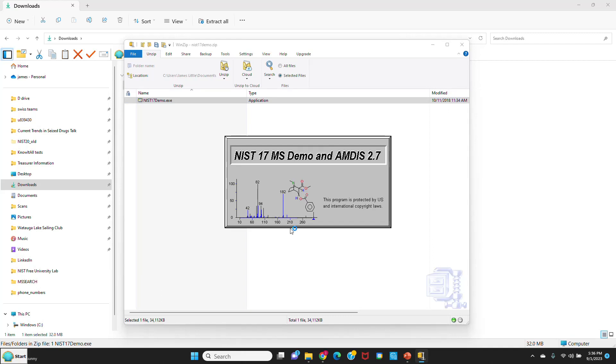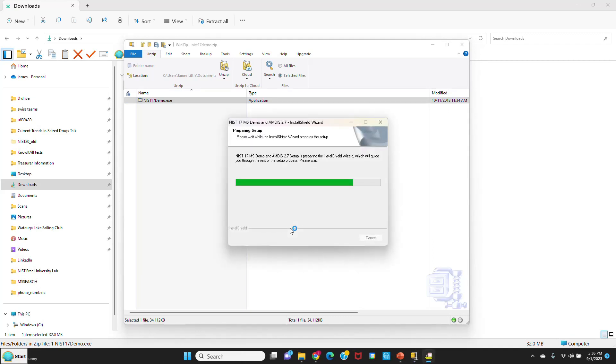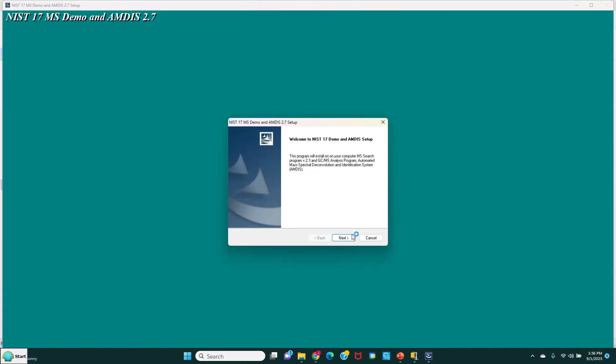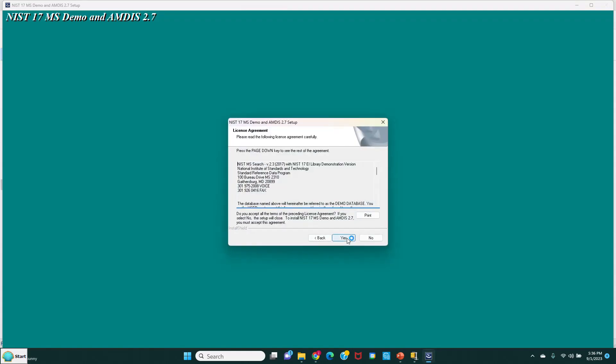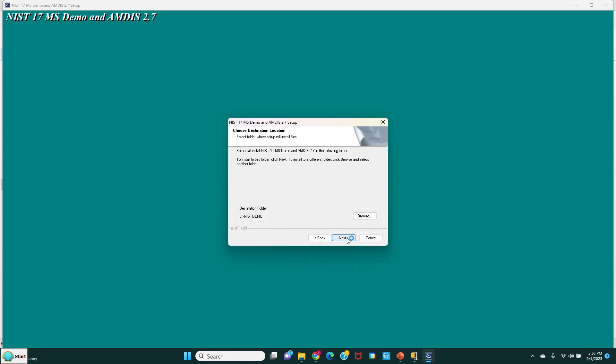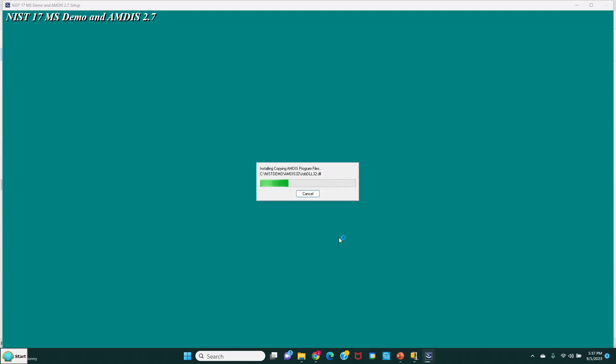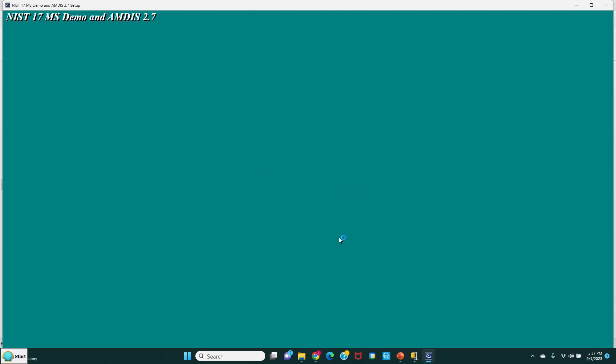We're going to take all the default settings. It's starting to install the NIST MS demo and AMDIS 2.7. We'll take all the defaults, so just say next. We're going to put it where it suggests, C NIST demo on our hard drive. Setup will add a program to the program file listed NIST 17. You can see the installation is starting, updating components. I'll just stay with you because the installation doesn't take very long. You don't have to reboot afterwards, though it's not necessarily a bad thing to reboot your computer. The setup is complete.